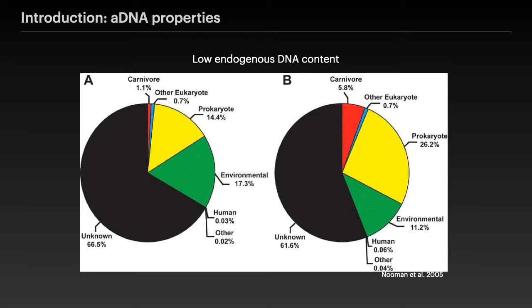And if we were planning, for example, to sequence a sample looking like that, to do what we call shotgun sequencing, to sequence the whole genome, that would, of course, cost us a lot of money, because that would mean that we would also sequence a lot of fragments that would be of exogenous origin.